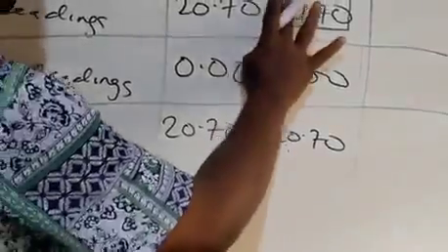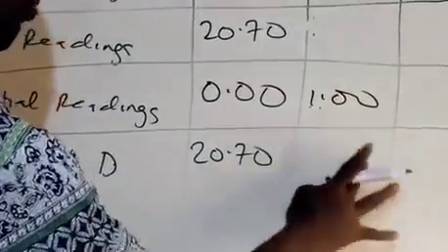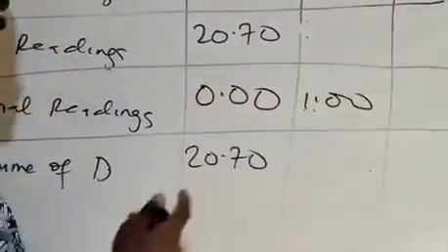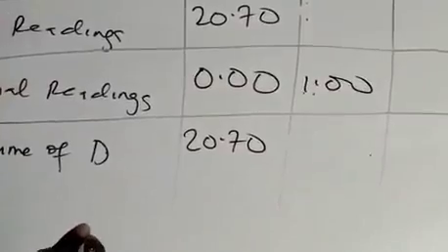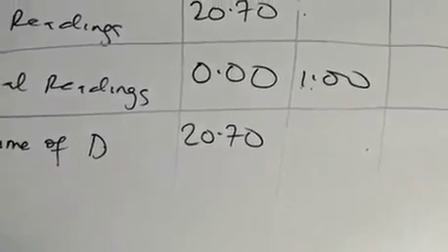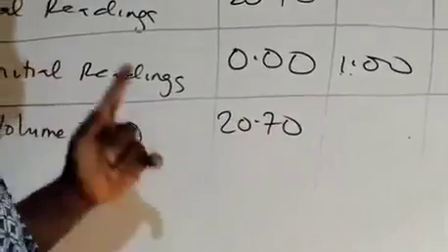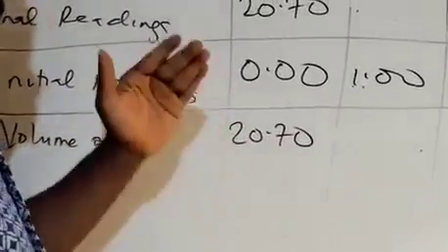So let's remove this. So our initial is 1.0. Then we'll now run the titration. We're going to add more acid and adjust to 1.0 and then run the titration to see when we're going to get exactly this value or something less. Remember, we're running it to 21 and then after we reach 21, we'll take it drop by drop.